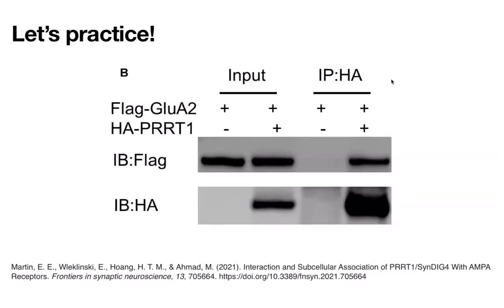What about in this case? Here we're looking at a different receptor, this GluA2, but the rest is the same. How do we interpret this? Are they interacting or not? Right, this is similar to before. We can see that they're interacting because we see both of them in our pull down.